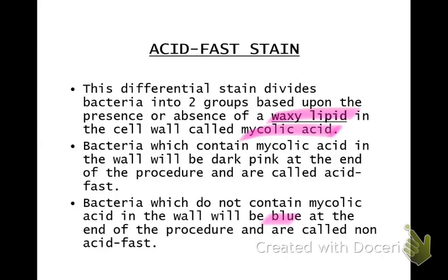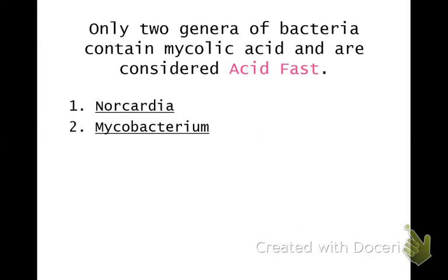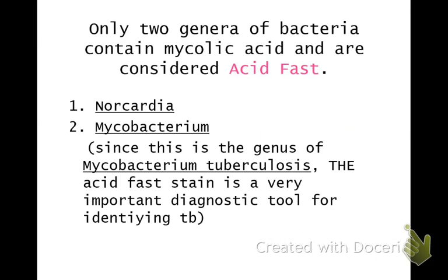And so this was a good test for tuberculosis. Mycobacterium is tuberculosis, by the way. It's leprosy too, but that's the genus of tuberculosis. But the skin test gives a false positive. And so a lot of times they'll do an acid-fast stain just to make sure that it's tuberculosis. And so I hope this was helpful.